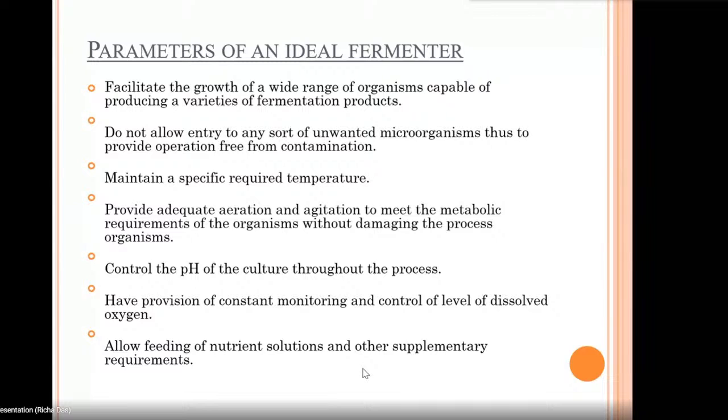So what is happening in the mixer grinder is, when we switch it on, whatever contents you have added in your blender are going to agitate, that is, they are going to mix. The meaning of agitation is mixing the contents. So I think these two terms are clear: what is aeration and what is agitation.